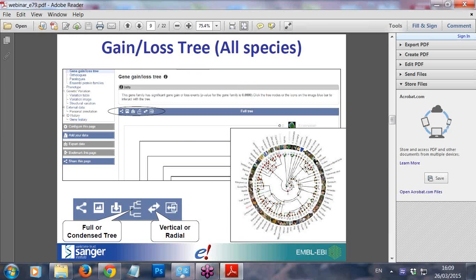What's new is that we've got a new code base, and it gives you the ability to see this in a radial view — the circular view — which might help with your analyses. That's the little arrow icon. You can also open a full or condensed tree, and you may find the functionality is a bit faster.